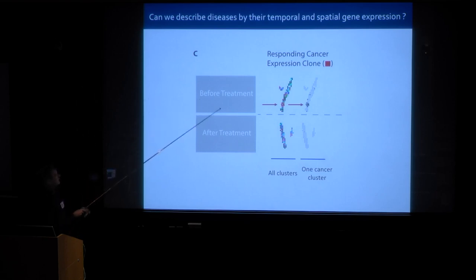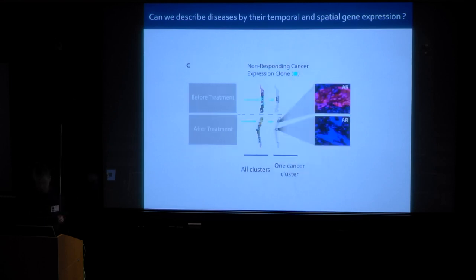So this is before treatment, you have a cancer here, and the pathologist confirms that it has red color here, and if you just look for this factor in this case, it's positioned there. And then after treatment, you could take a new biopsy. Obviously, it will not be the same position, but you look for these red ones, and in none of the biopsies that we take, we could find these cancer clones. So this is really a responder, similar to the one that I showed before.